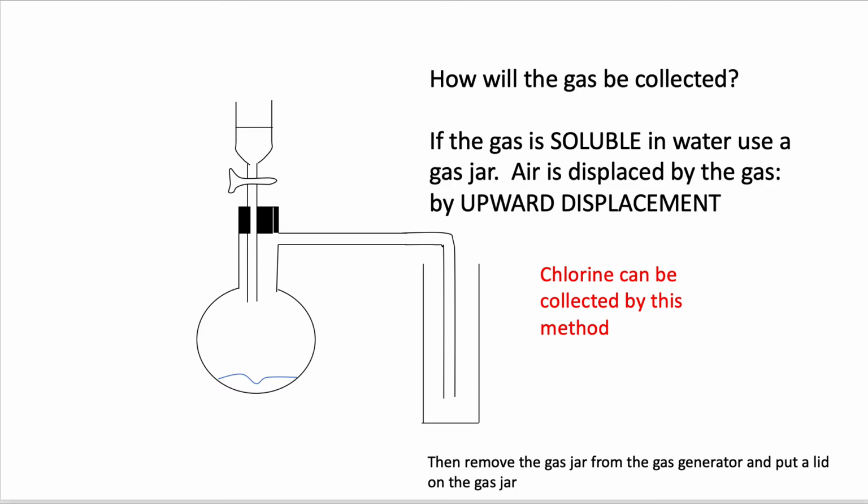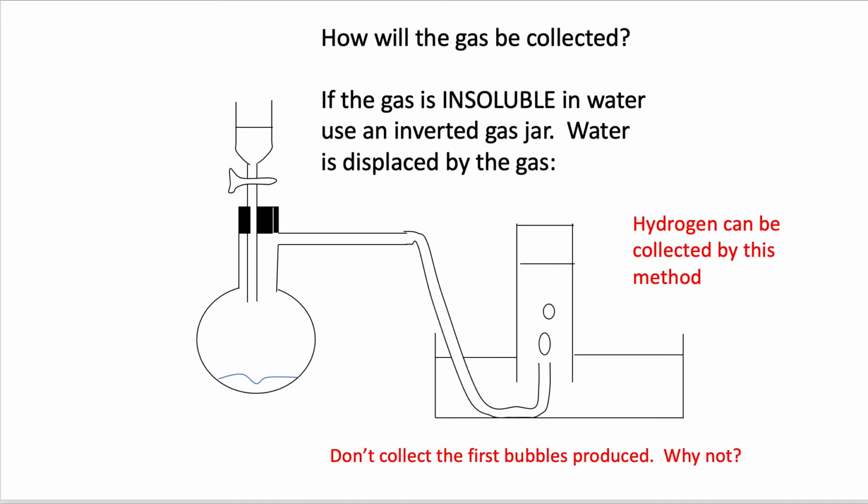There still will be some water there. It helps if the gas is insoluble, because you bubble the gas through water. There's downward displacement of the water, and albeit wet gas, but you just have the pure gas there, no gases in the air mixed with it as well.